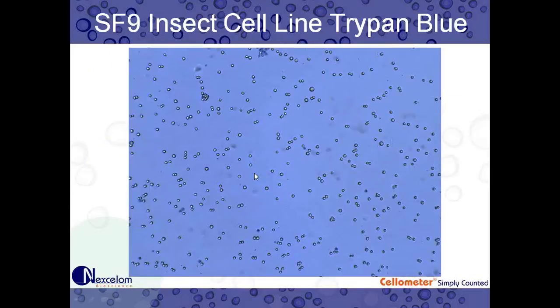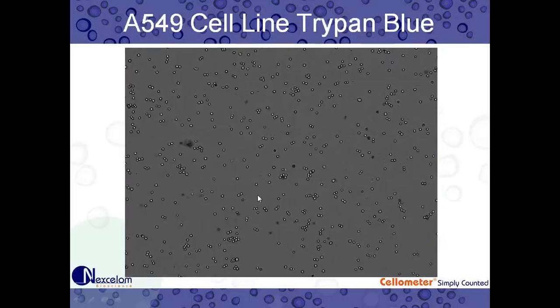Here are some images. This is an SF9 insect cell line stained with Trypan Blue on our Auto T4 software. You can see it has a nice blue color in the background, and you can make out some dead cells as you scan the image. This is our A549, a human alveolar basal epithelial cell on our Vision — it's not blue due to differences in optical hardware. You can visually see our live cells with a distinct round membrane and bright center, and our dead cells stain dark for the Trypan Blue.